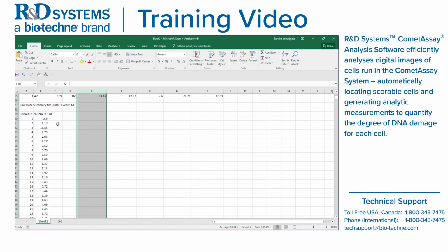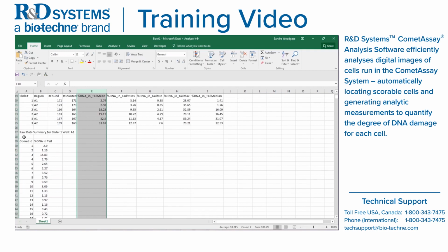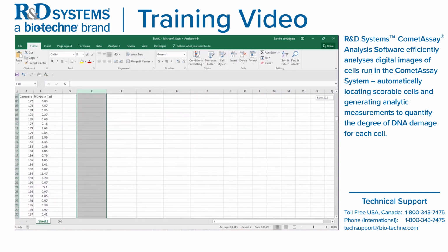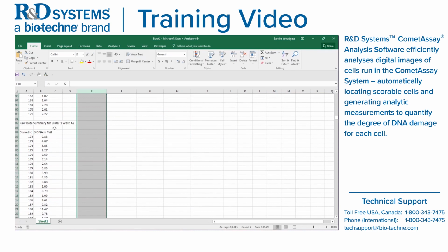Underneath, we also selected that we wanted to export the raw data. So below here, this is slide 1, well 1, and you identified so many comets which were arbitrarily numbered 1 through 171. For comet 1, the associated damage parameter was 2.9% DNA in the tail. And if you scroll on down, you have it for all of them, so here is well 2 on slide 1, etc.